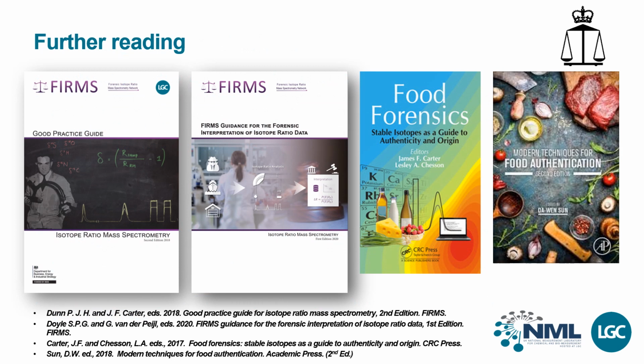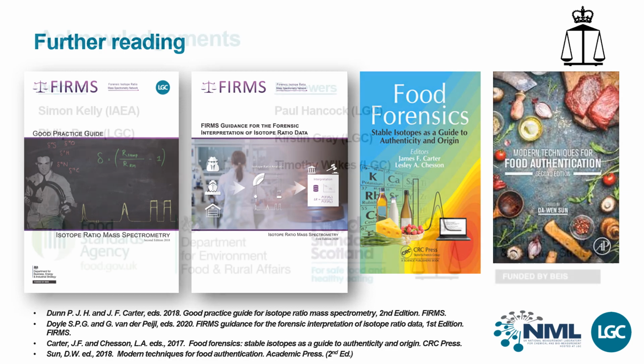Further resources on isotope ratio analysis in general or its application to food authenticity can be found in these publications. Both are freely available from the FIRMS network website. For stable isotope analysis of foods, the book edited by Leslie Chesson and Jim Carter on food forensics is an excellent resource, as is Modern Techniques for Food Authentication, edited by Da-Wen Sun.